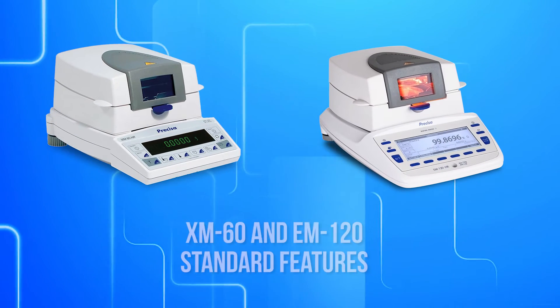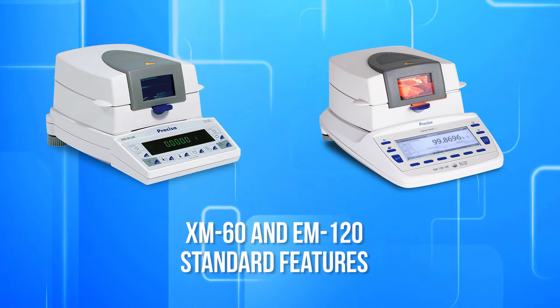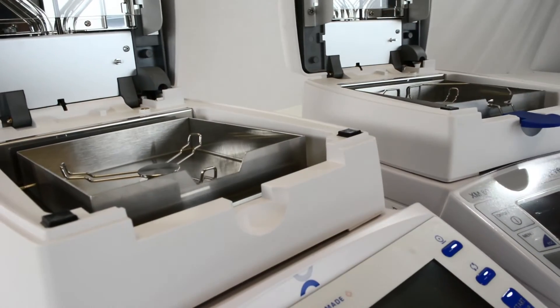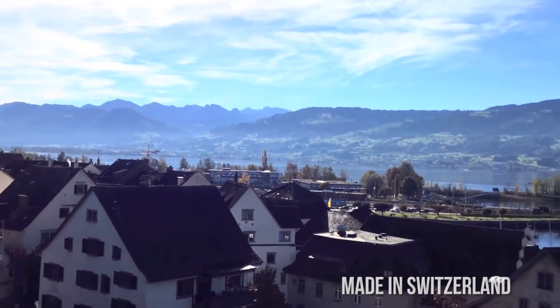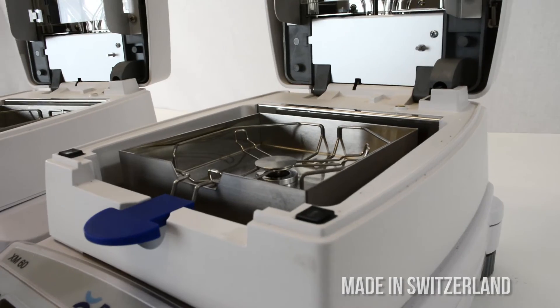Before we show what separates these two balances from each other, let's first discuss the great features that come standard in both the XM and EM. The XM and the EM use a force restoration weighing system, the same respected Swiss technology you'd expect from an analytical balance. The Precisa balances are manufactured in Switzerland with a solid cast aluminum base that's built to last.